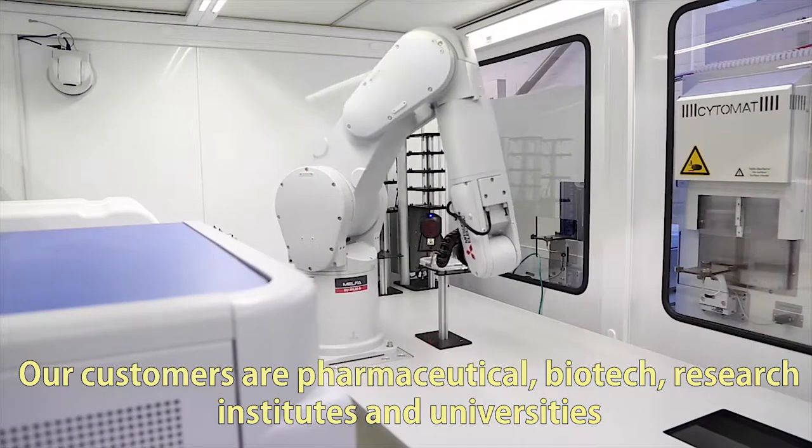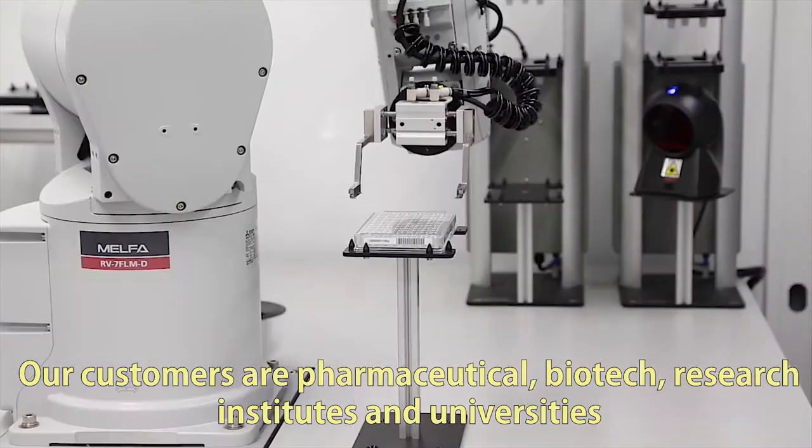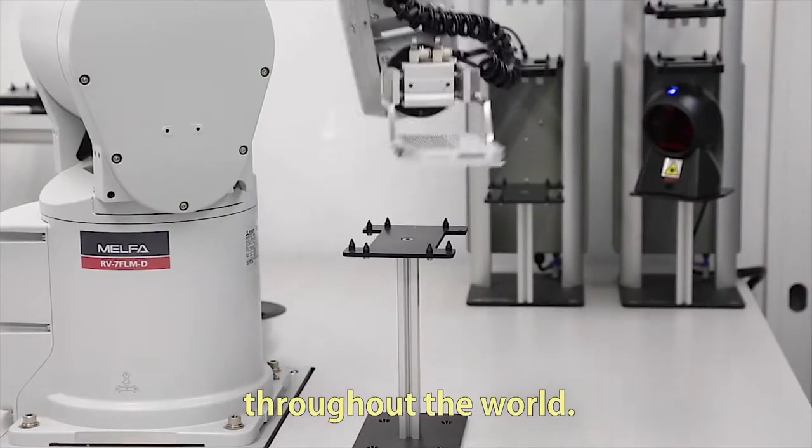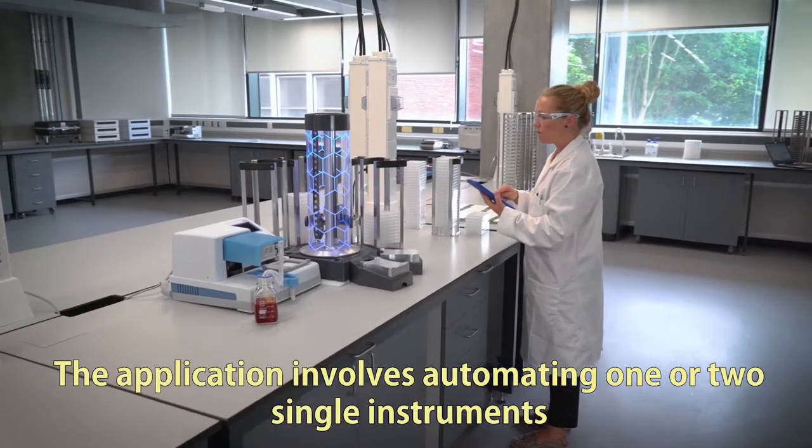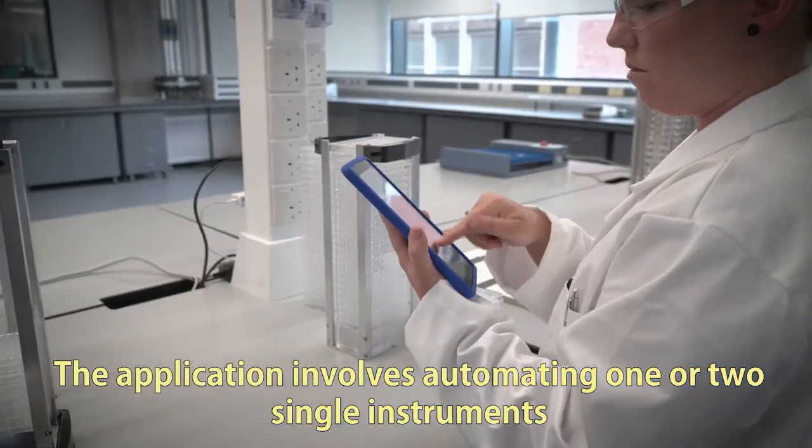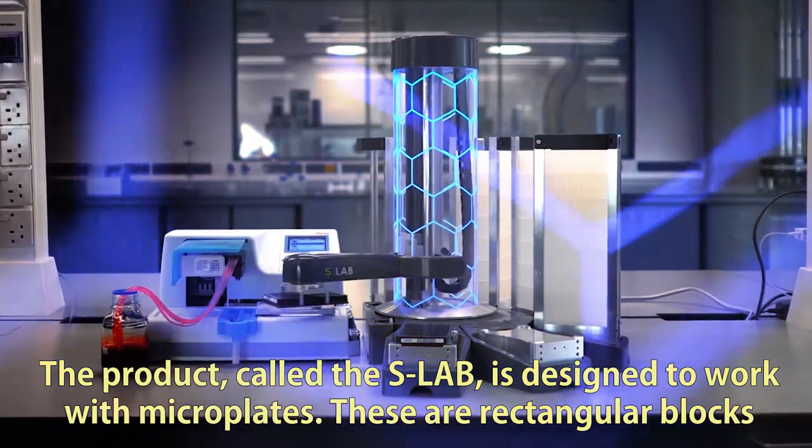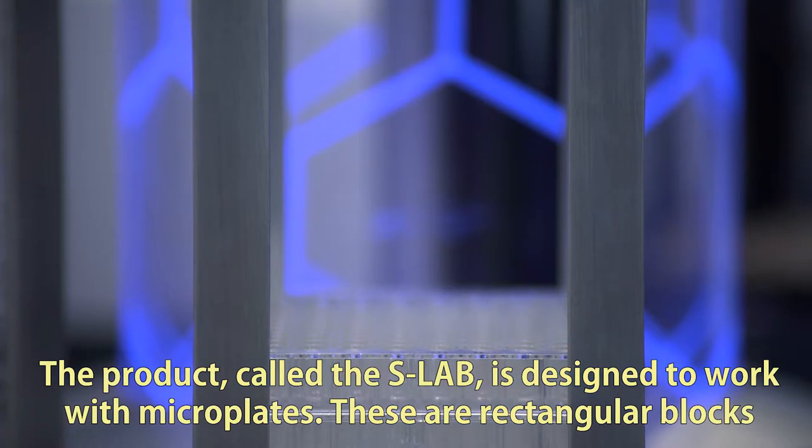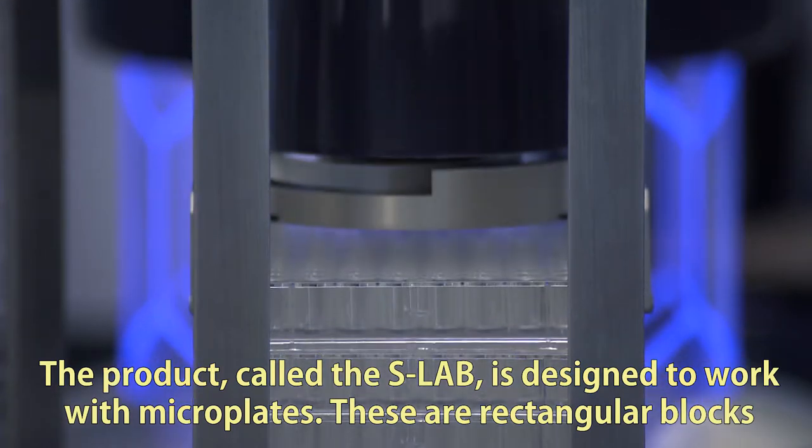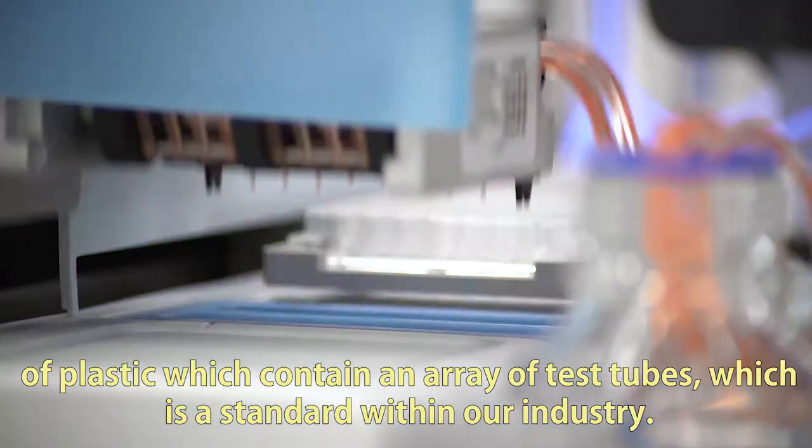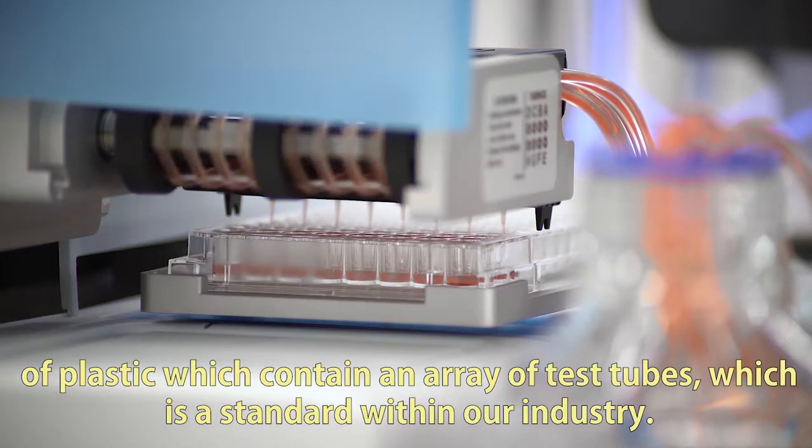Our customers are pharmaceutical, biotech research institutes, and universities throughout the world. The application involves automating one or two single instruments which are commonly found in laboratories. Our product, called the S-lab, is designed to work with microplates - rectangular blocks of plastic which contain an array of test tubes, which is a standard within our industry.